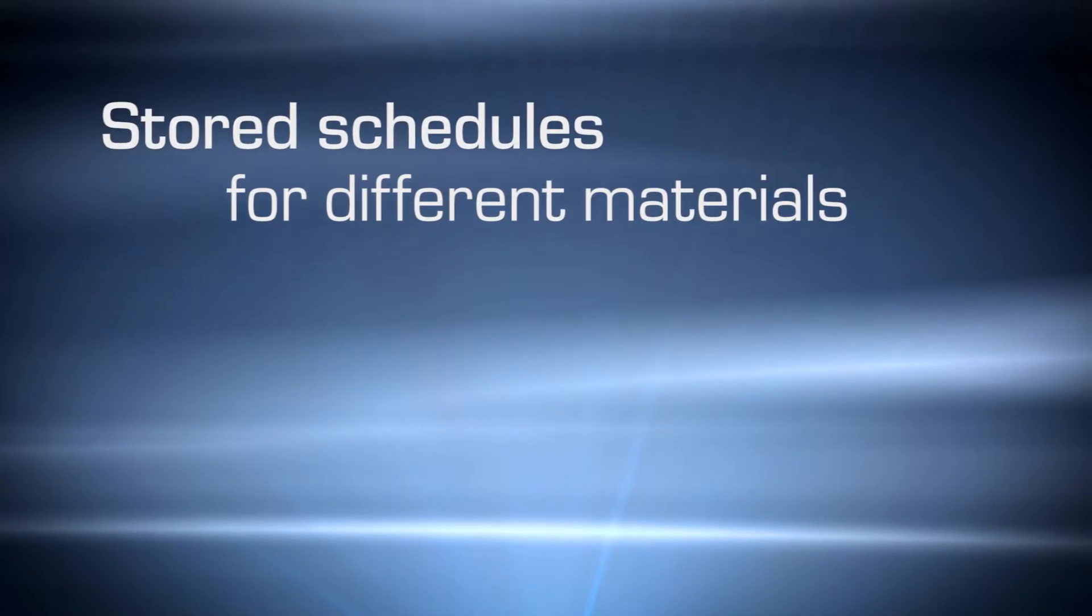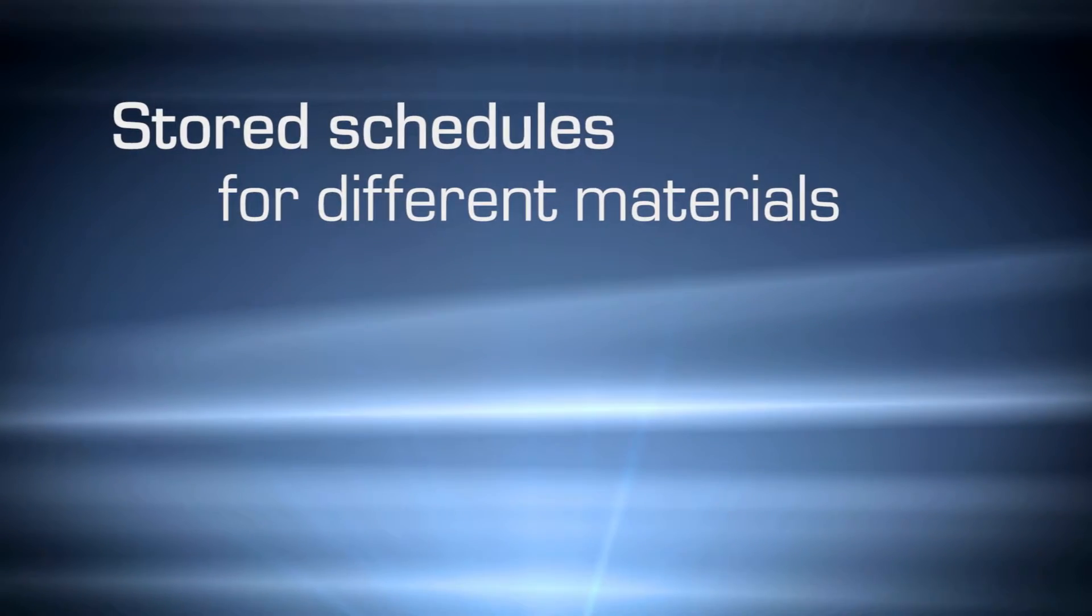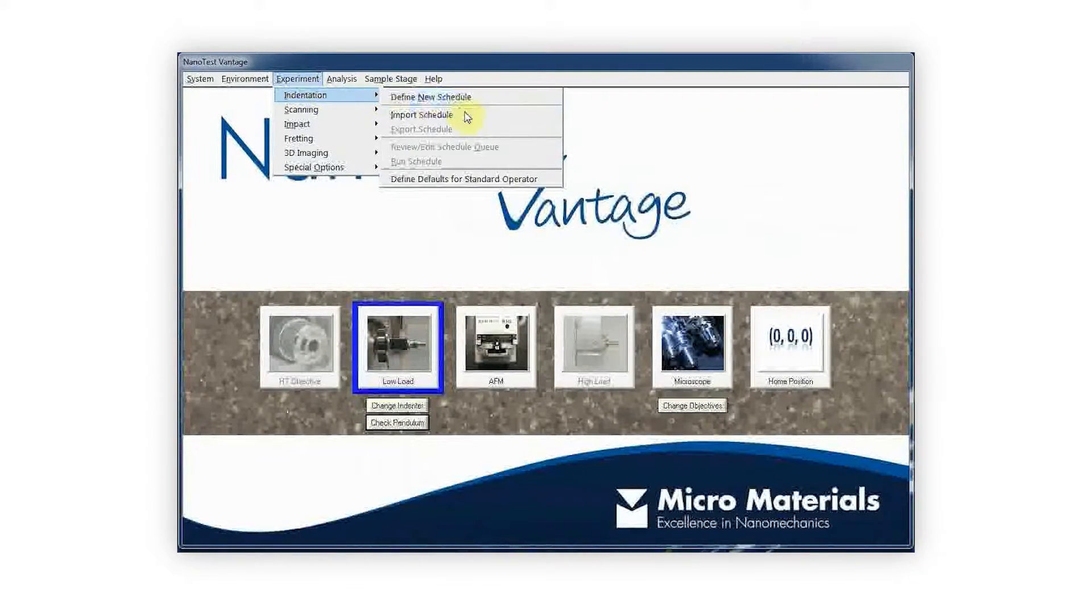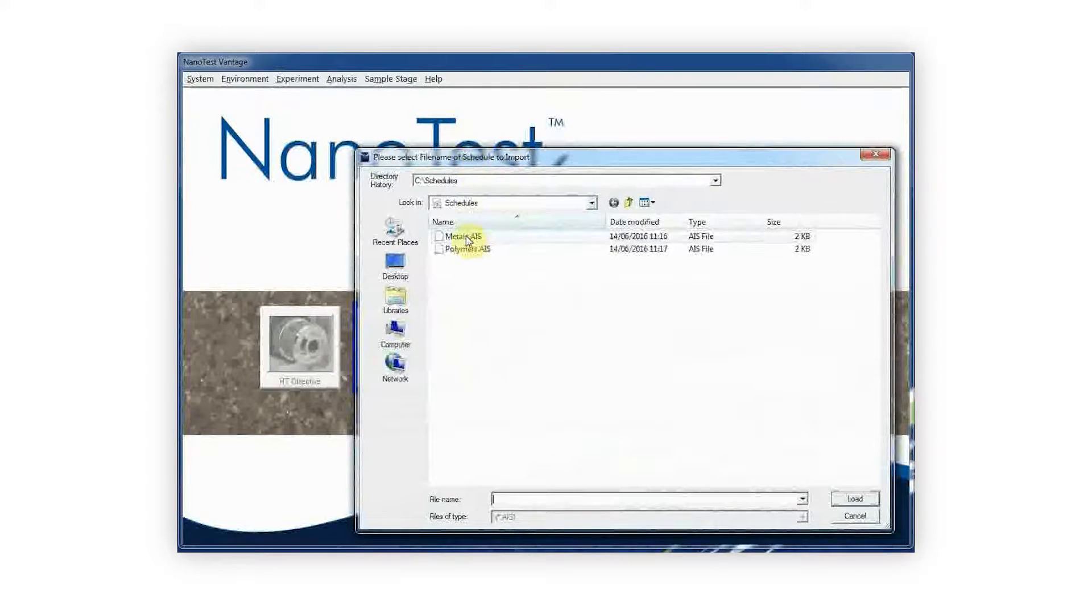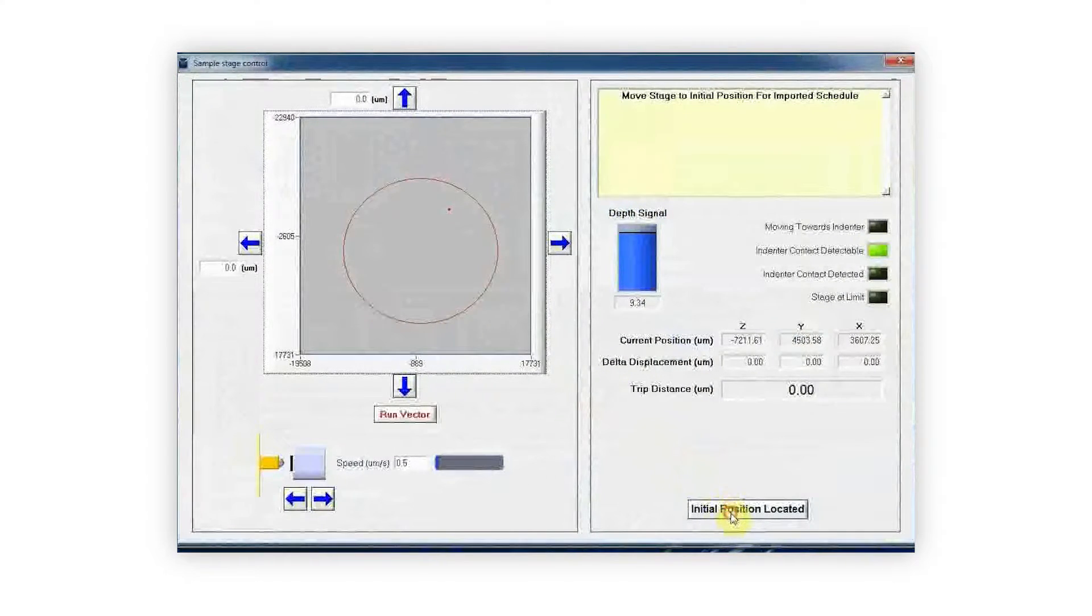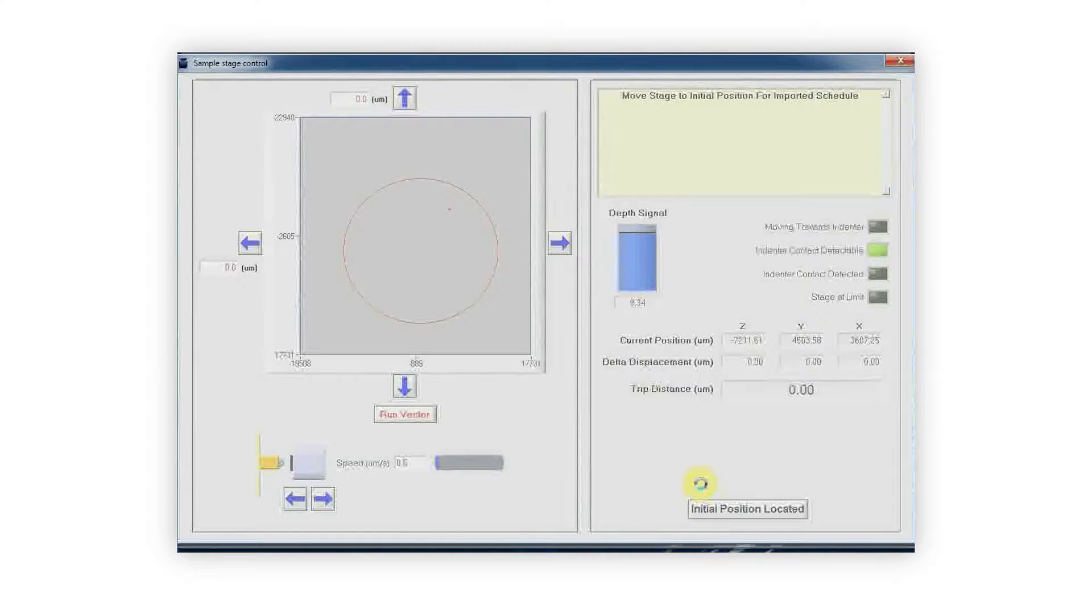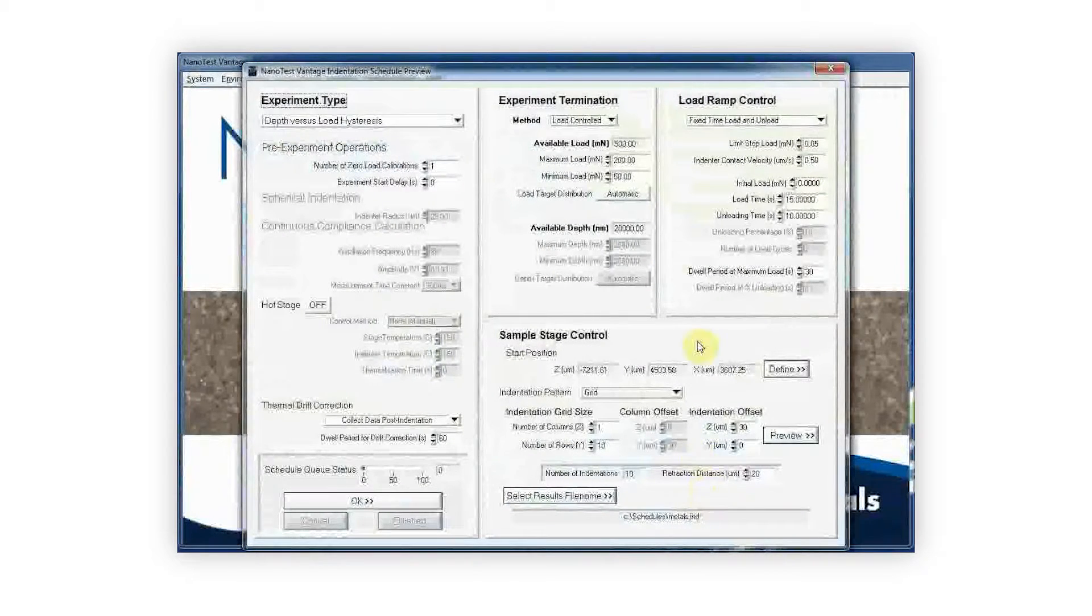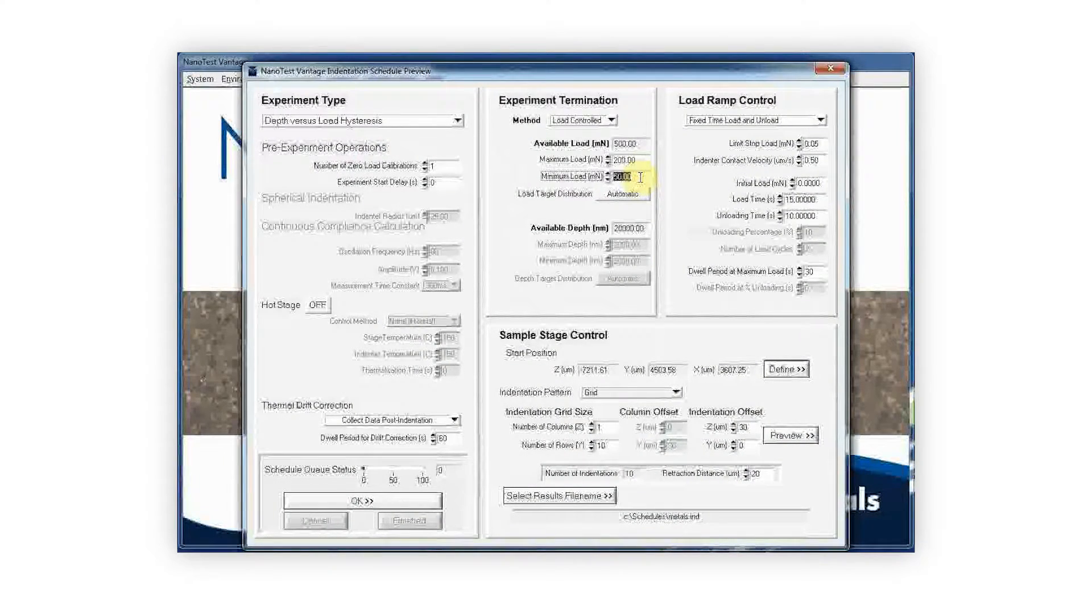The NanoTest software package comes with stored schedules. These are experiments with predefined parameters for different types of materials, such as polymers, metals and ceramics. They are intended to help new users with experiment design in order to get the most out of the instrument straight away.